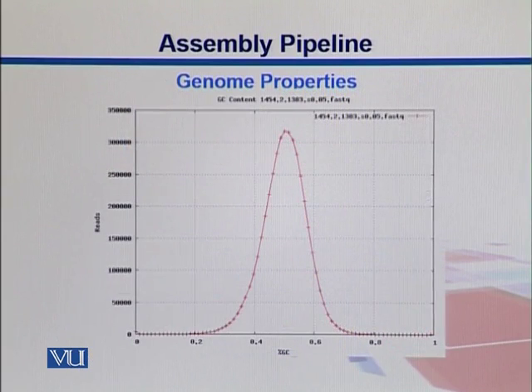The first metric is where we compare the genome properties in terms of GC content. In eukaryotes, as we have seen in our human genome project lecture, around 40 to 45% of the human genome is GC. Roughly, in the eukaryotic genome it's around 45, or we can say around 50%, made up of GCs. Do we see this similarity in our short reads? If it is approximately close to that, we can select that.